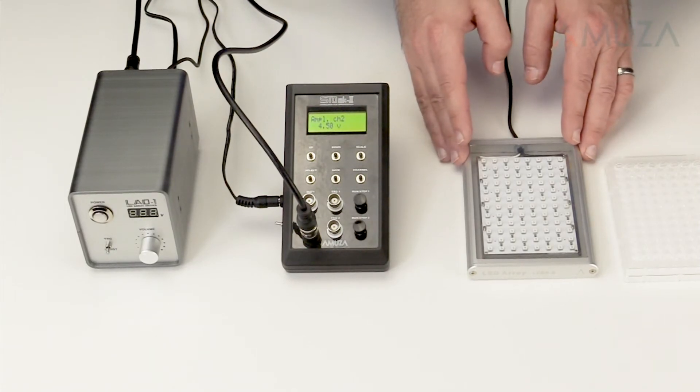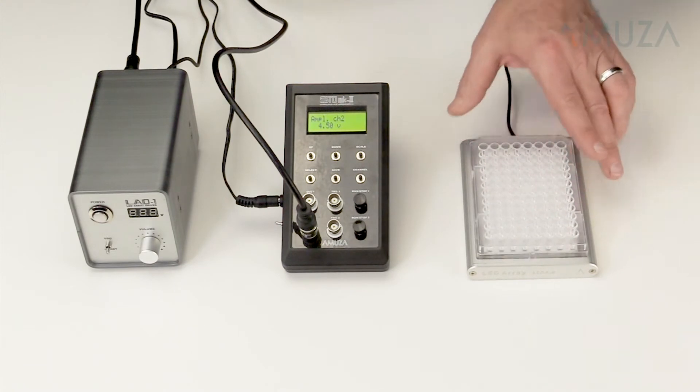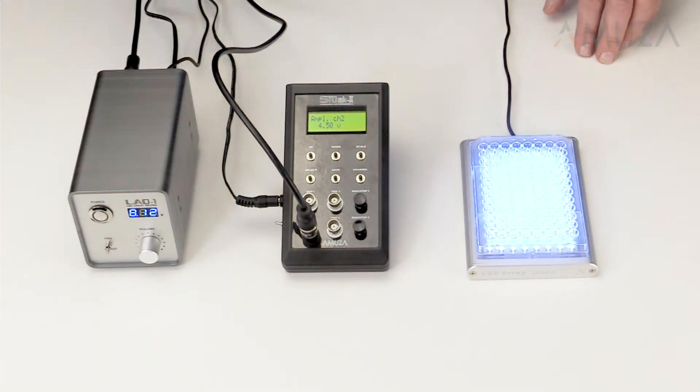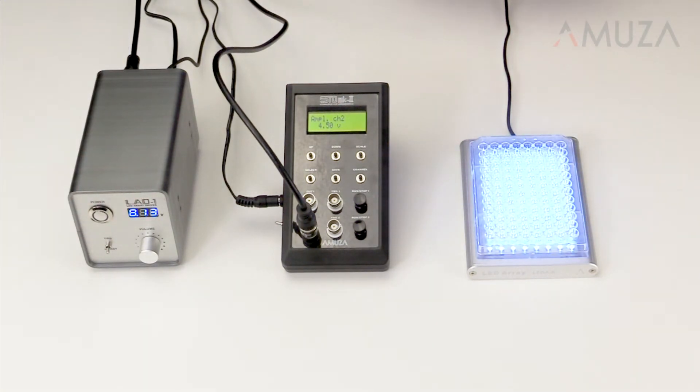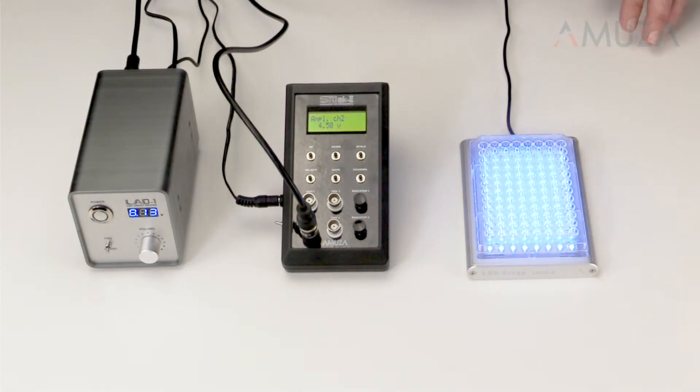This is our most popular LED array. It is perfectly sized for a single 96-well plate. It has 96 LEDs with emissions centered at a blue 470 nanometer wavelength. A lip surrounding the array locks your plate into place so that the well stays centered over the LEDs.